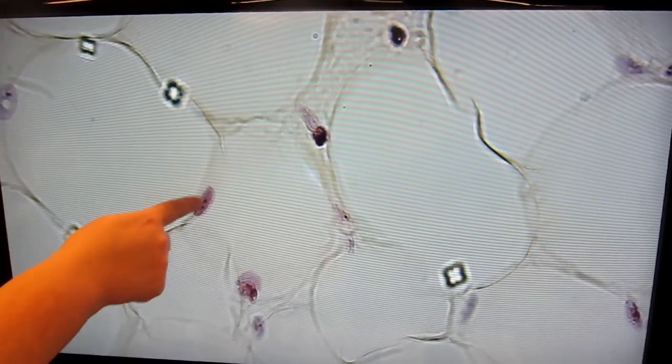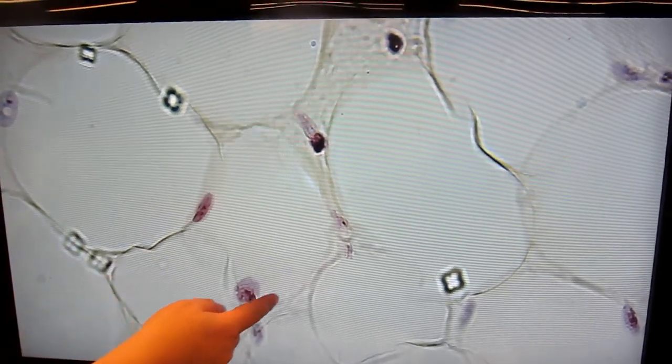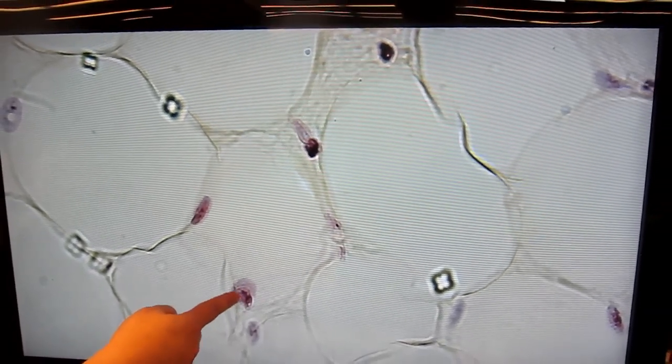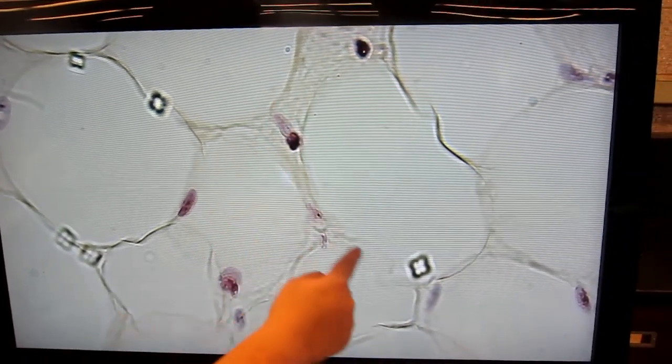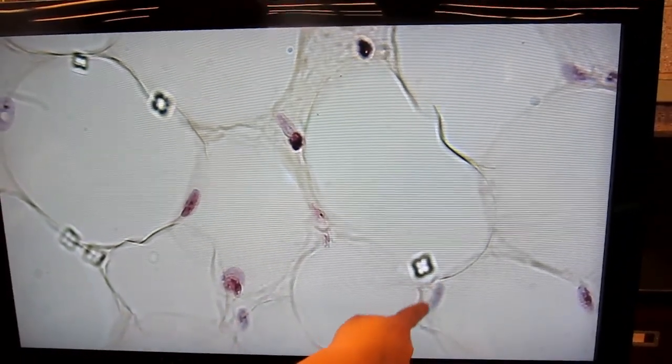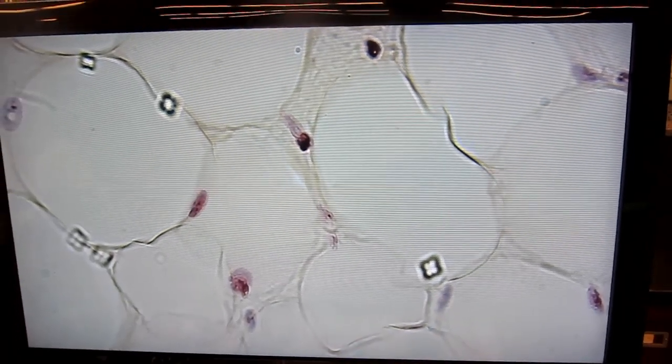This particular cell you can see a nucleus. This one, kind of hard to tell, there might be one here. This one doesn't look like you see a nucleus at all. This one either. And this one's a little bit out of our frame. That one might have a nucleus.